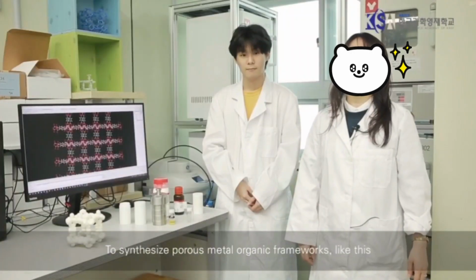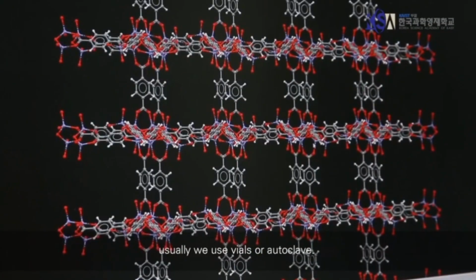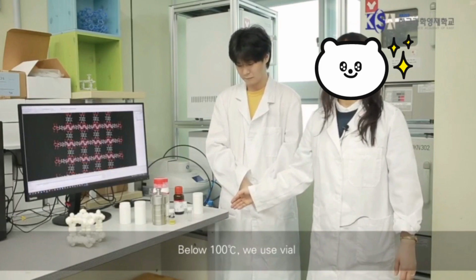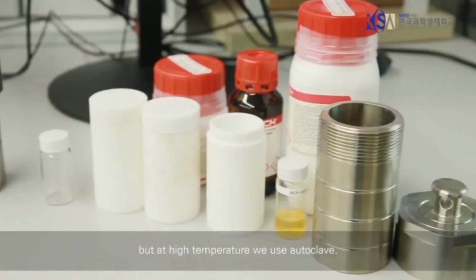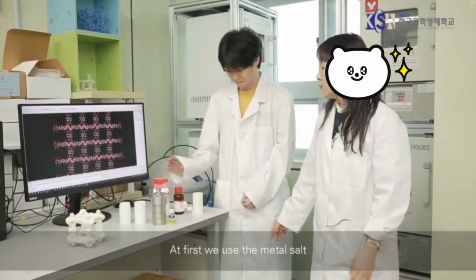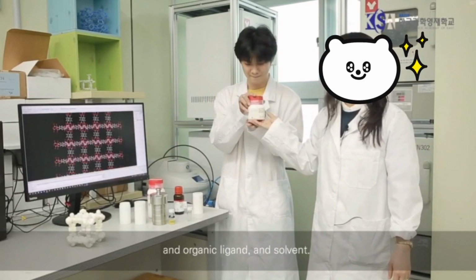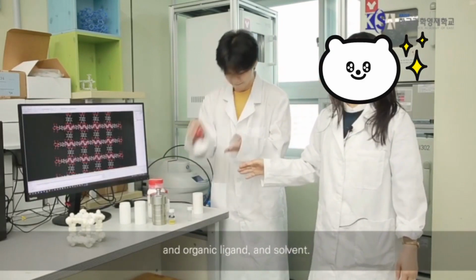To synthesize porous metal-organic frameworks like this, usually we use a vial or an autoclave. Below 100 degrees we use a vial, but at high temperature we use an autoclave. At first we put the metal salt, organic ligand and solvent.